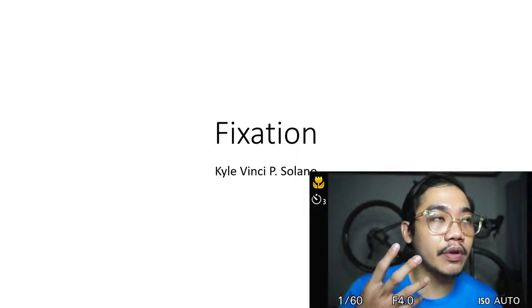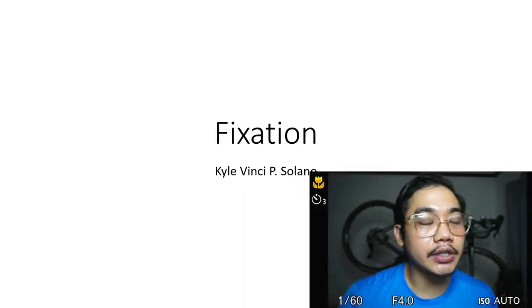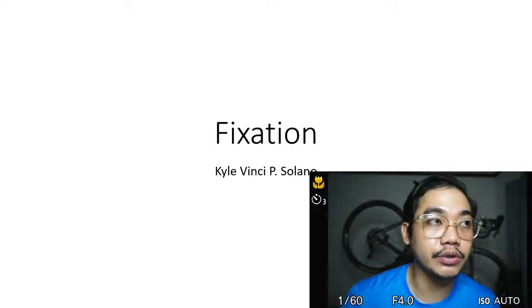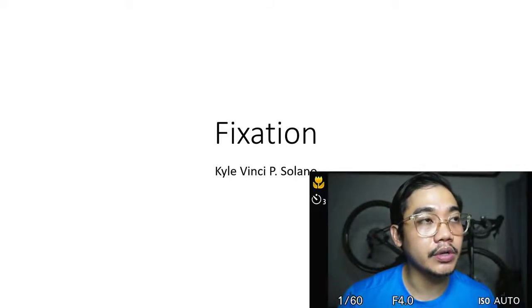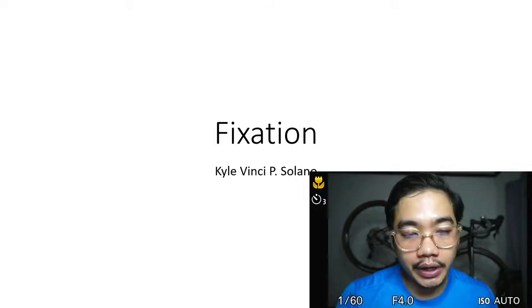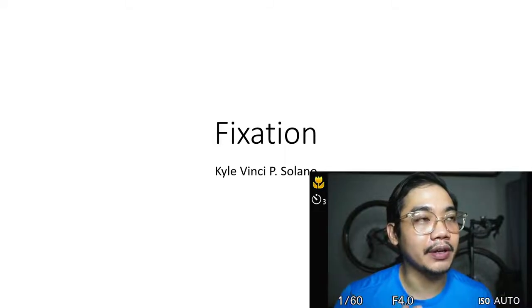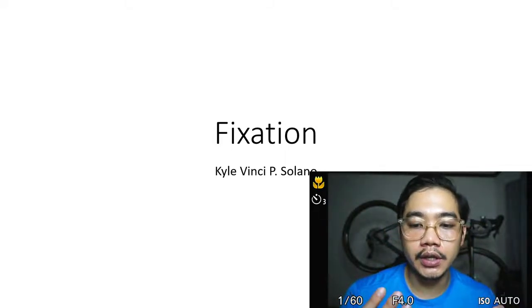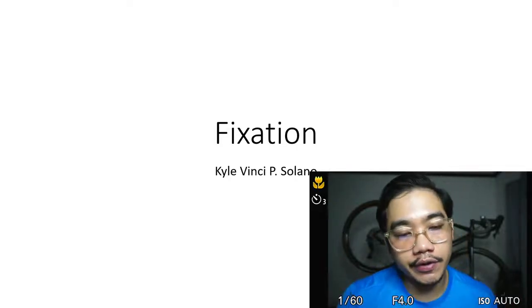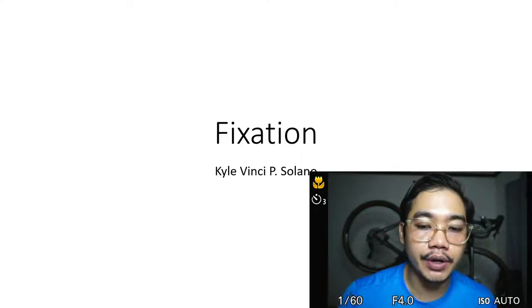Another thing that the fixative does is it stops bacterial decomposition, also known as putrefaction. It inhibits it so that the bacteria will also be killed in the area. It doesn't discriminate whether it's human tissue or bacterial colonies. It kills everything, which is very beneficial for the ones handling it.